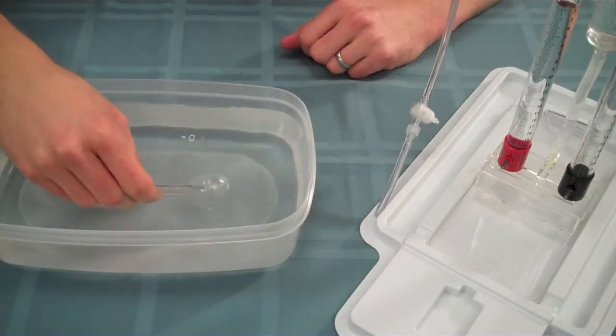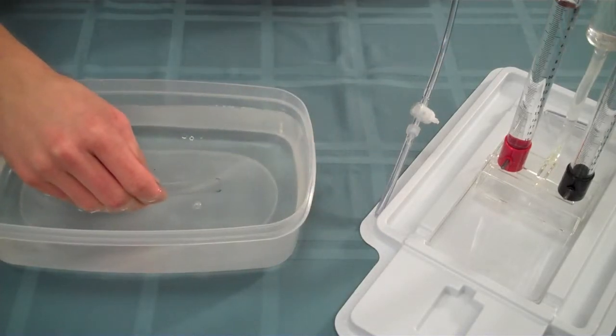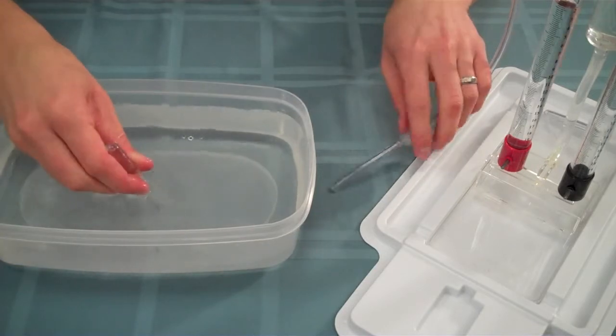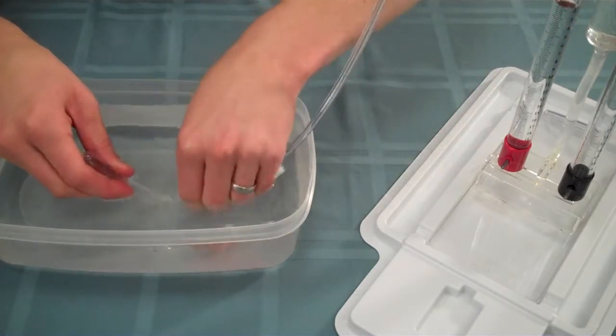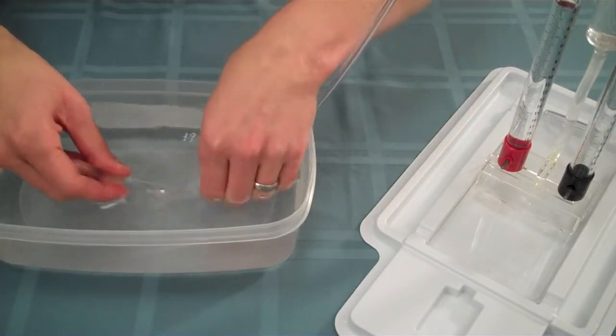First, submerge a 10-milliliter test tube in a basin of water so that the test tube is completely full of water. Then, invert the test tube. Place the end of the gas supply tube into the mouth of the test tube.